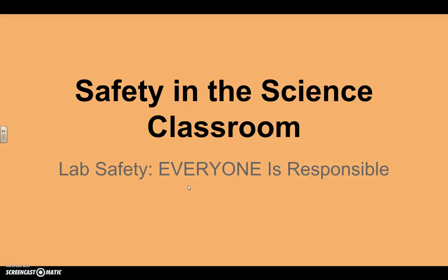In this video series, we're going to be talking about safety in the science classroom and appropriate behaviors while you're in a science classroom. And it's important before we get started that everybody realizes that everyone is responsible for lab safety. There's no single student's responsibility to be safe in the science lab. Everything you do affects everyone else.